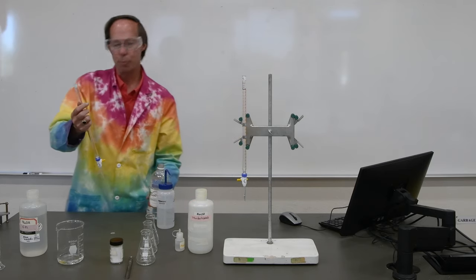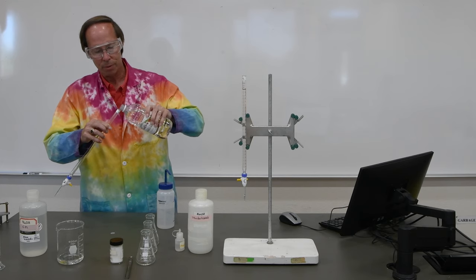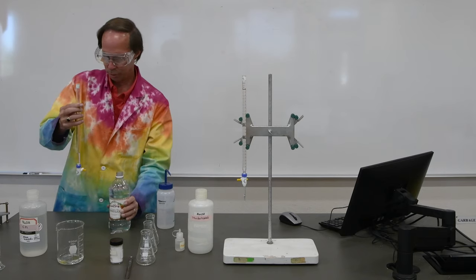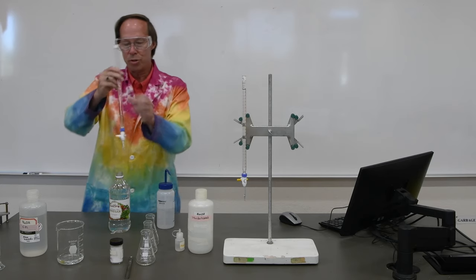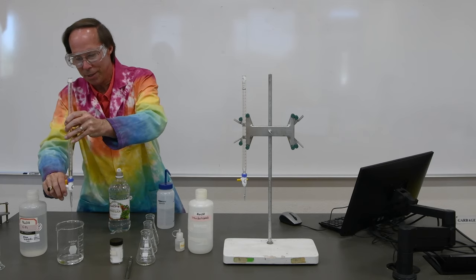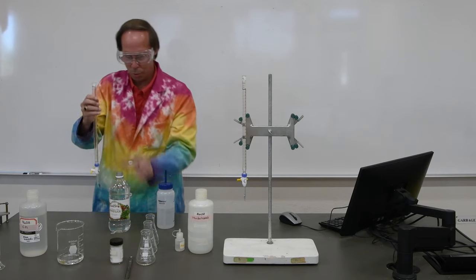So we'll do a couple of rinses with the vinegar, just like we did with the deionized water, because we've got to get all that deionized water out of the burette. So put a little bit of the vinegar in there. We'll swirl that around to try to rinse out the water, and then let that drain out to get any water out of the tip of the burette that might be in there. And let's go ahead and do that one more time.